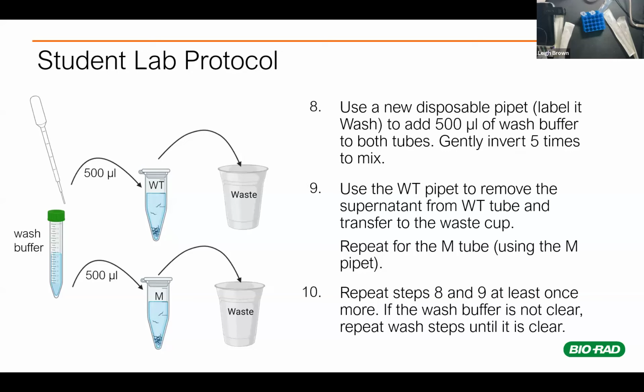This is something that I see usually every time I run this: I rarely will have mutant and wild type with the exact same proportions when I'm doing the washes. I think it depends upon the starting conditions of the worms getting on the original plates and growing out; they'll end up at different overall proportions on the plate. Like Lee said, it's nothing to worry about because we're going to be sampling such a small amount of them and doing an analysis on a small statistical portion of them.